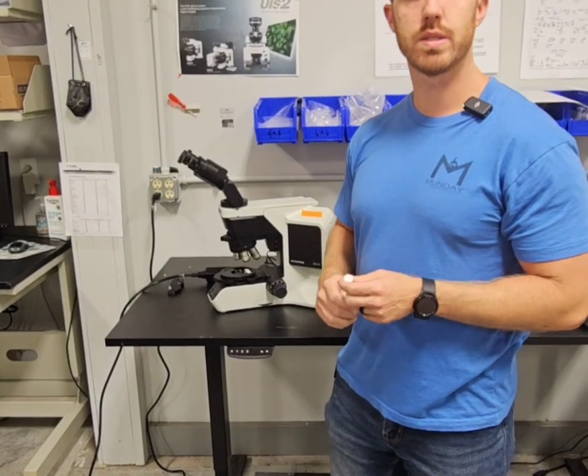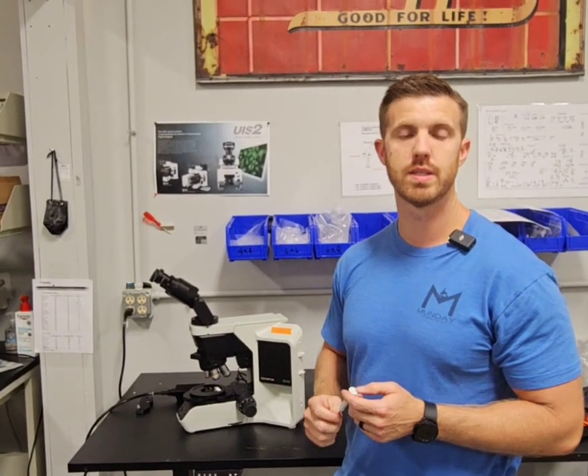And you'll have light again. So if you have any questions, give us a call at 919-775-5596, or you can find us online at mundaymicroscope.com. Thanks.